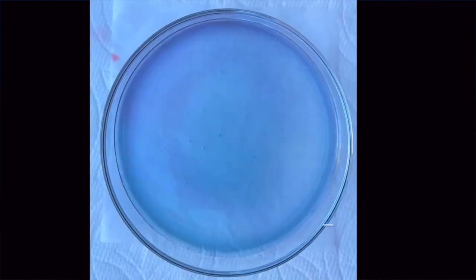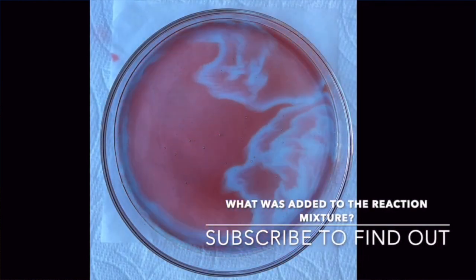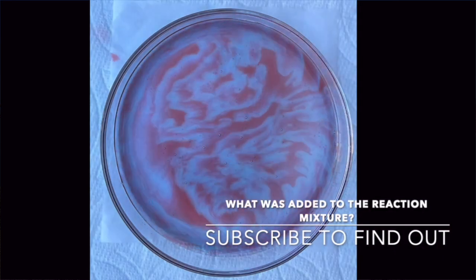In one of the previous episodes, I left an open question. In this BZ reaction, the waves appear to be much more curly. Make sure to stay until the end of the video to find out its secrets.